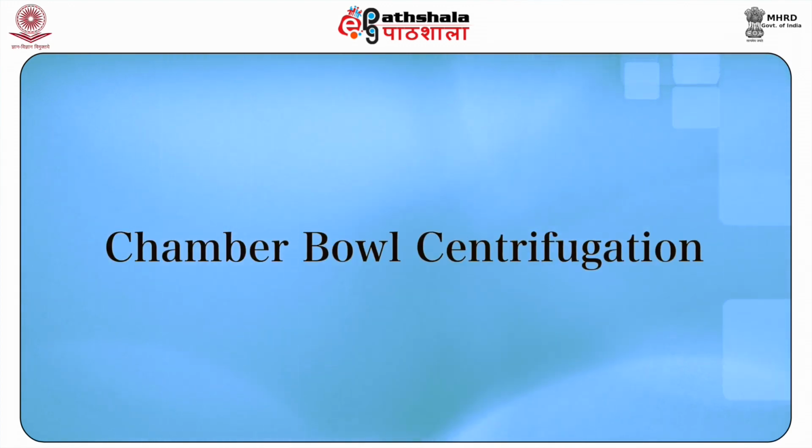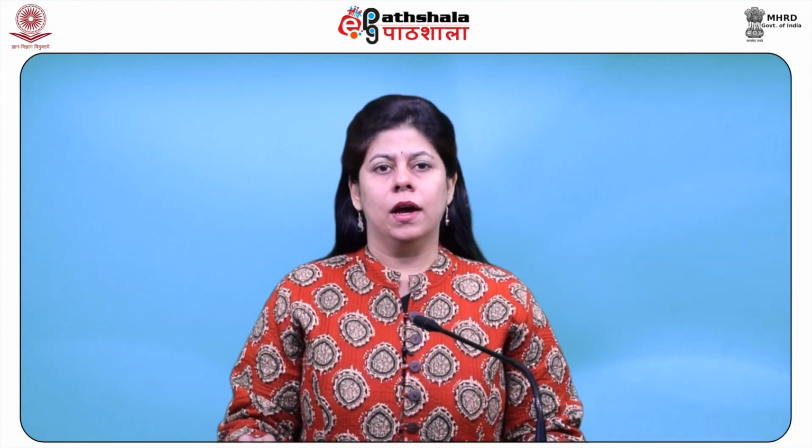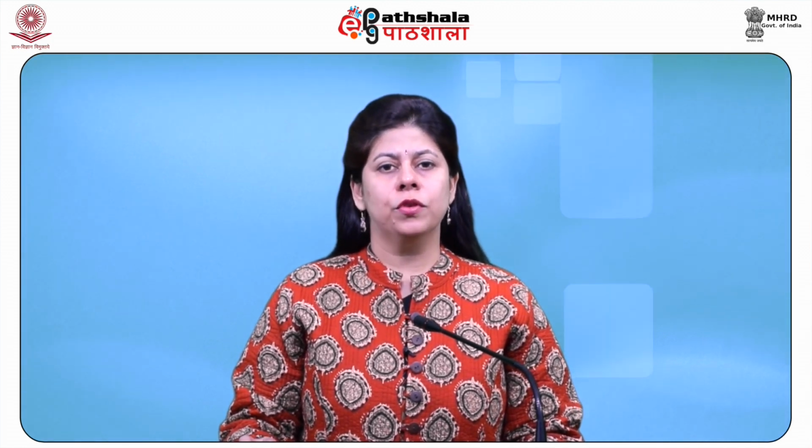Chamber bowl centrifugation. The chamber bowl with intermittent discharge has no disc stack. The chamber bowl is like a tubular centrifuge but with insignificant L by D ratio. It is appropriate for moving viscous feed or more concentrated solid feeds. As discussed, the clarification capacity is less than that with the disc stack centrifuge due to a reduced settling area.